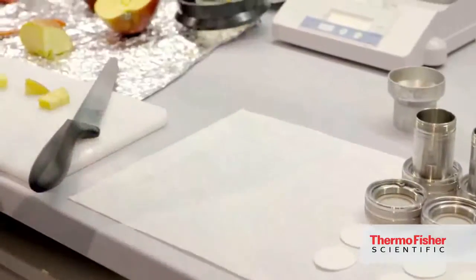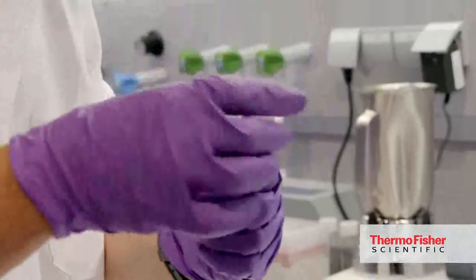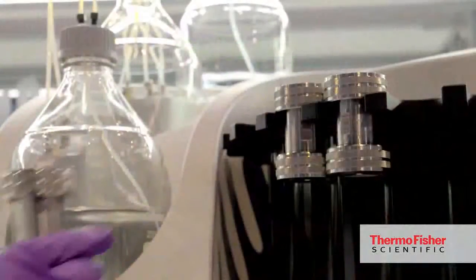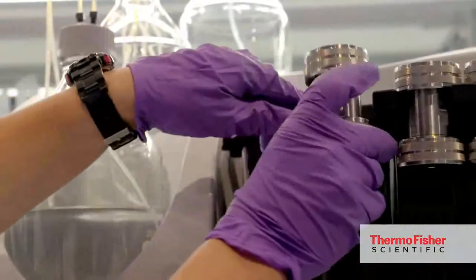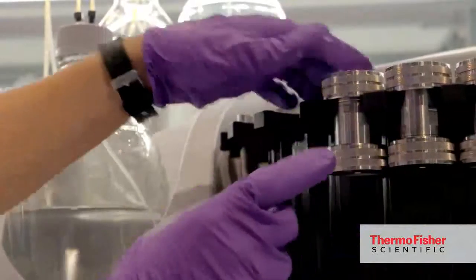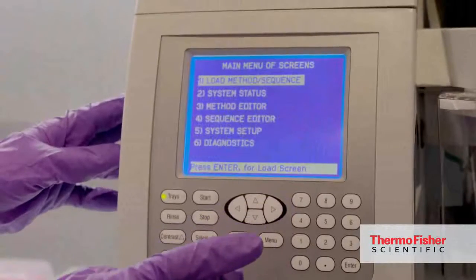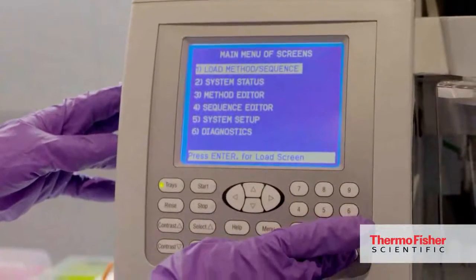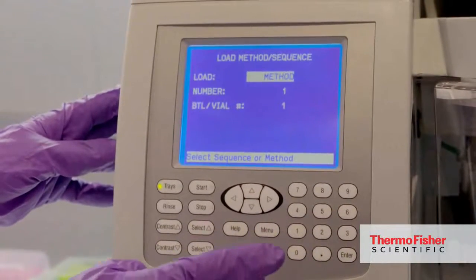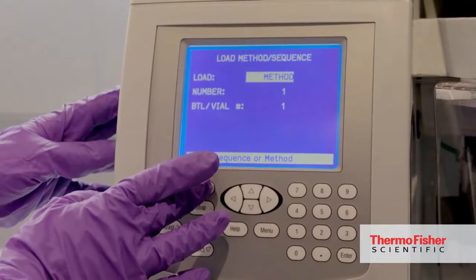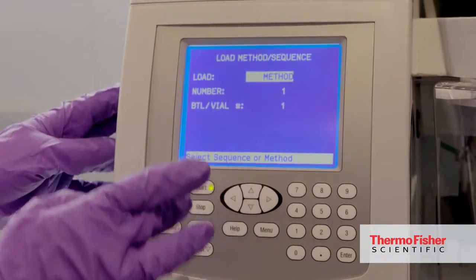And then close the cell which is ready for extraction. So the ready cell is placed into the tray of the ASE. Different sizes can be put. Whenever it is ready, then we simply need to program the method and start the ready method by clicking on the start button.